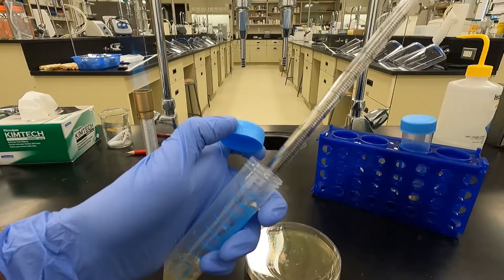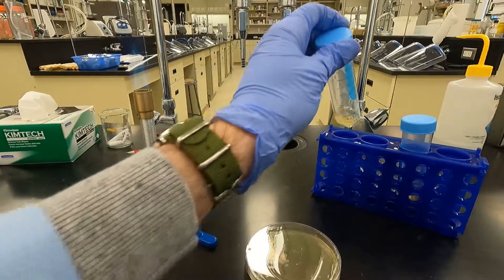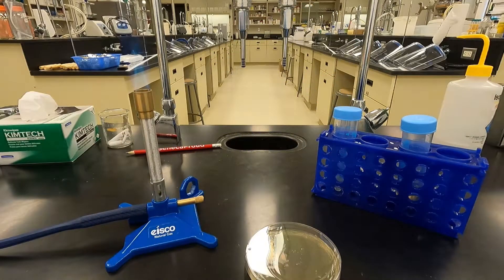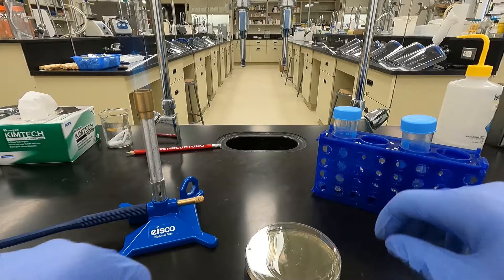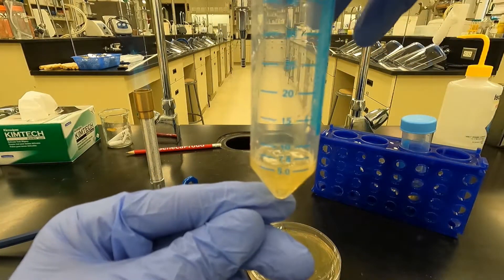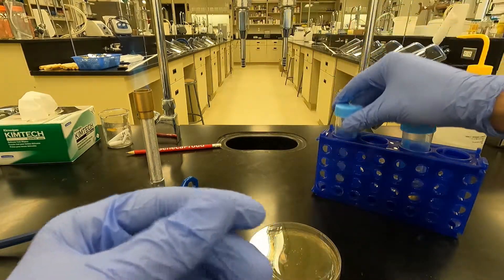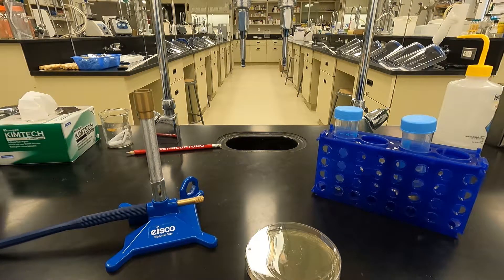Also rinse down the side of the tube with that. So there it is. The next step is to lyse the E. coli in there with some chloroform. I've got to check my volume here to see how much I have, and then I'll lyse it and continue on with the rest of the protocol.